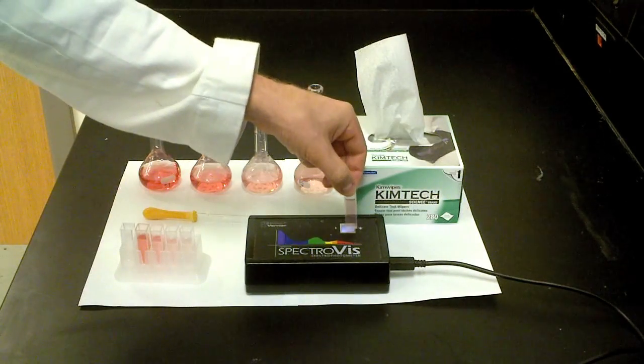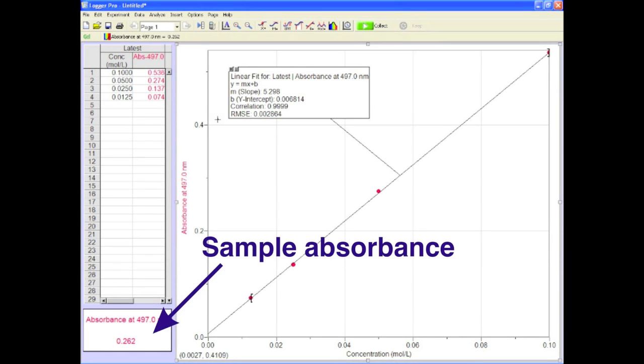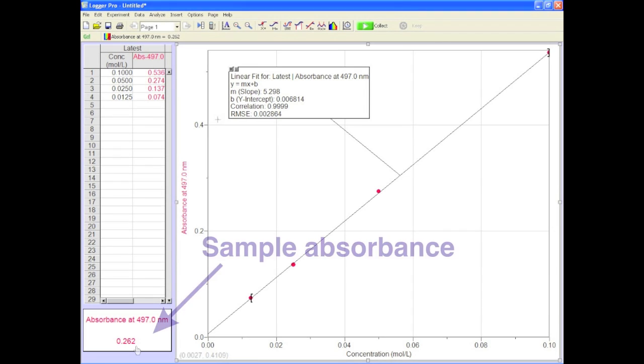Next you need to measure your unknown sample. Stick it in the spec and record the absorbance in your notebook. You don't know its concentration so don't worry about trying to keep it, you just need the absorbance. That's it.